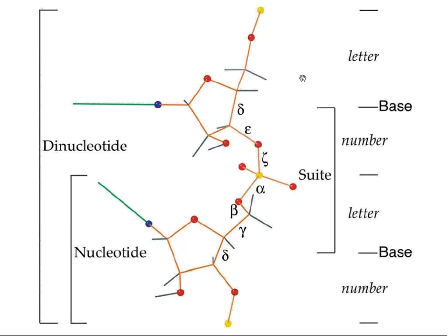So the other reason for the problem is that there are too many variables per observable, basically. One nucleotide has somewhere between 6 and 9 parameters, depending on what you count.